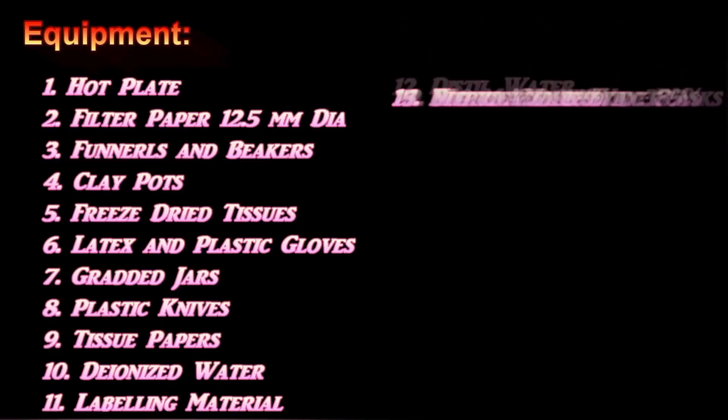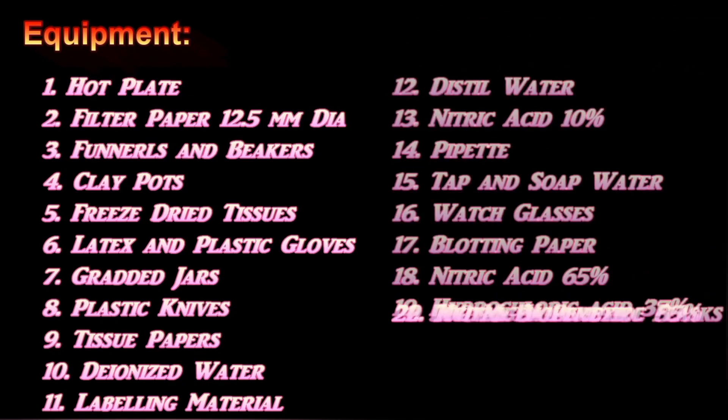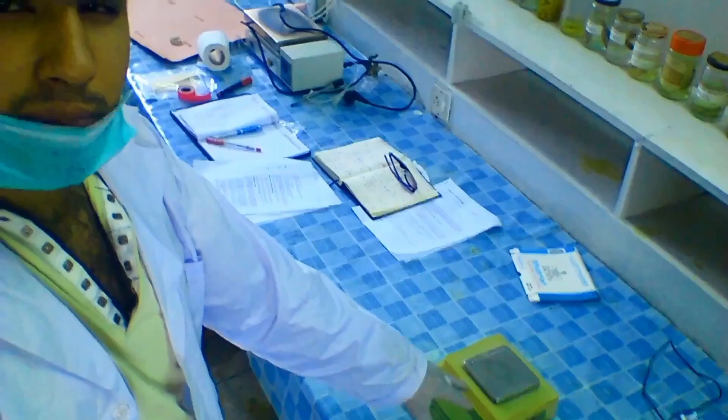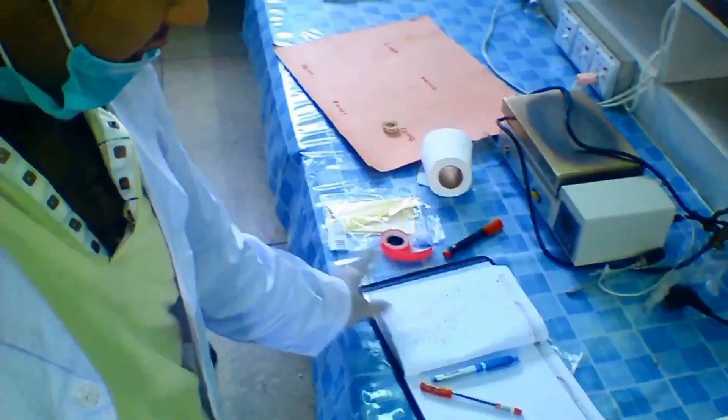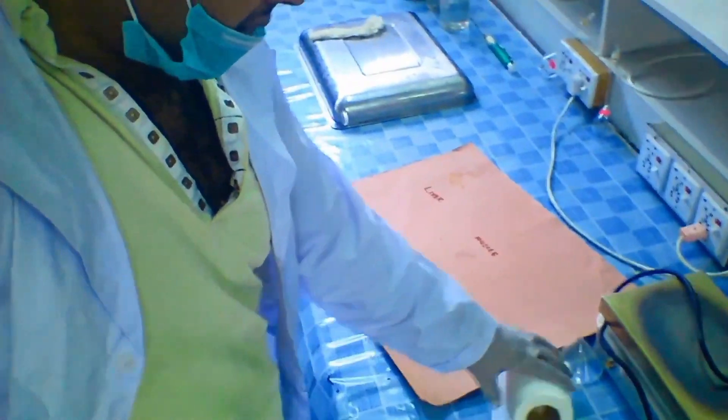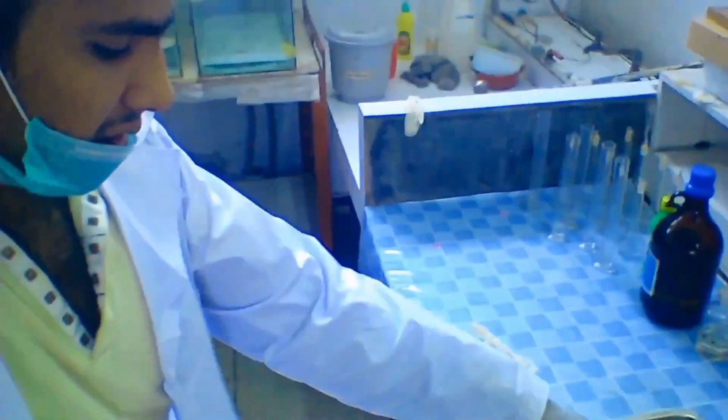The list of apparatus required to complete the process of acid digestion is on your screen. But first you have to clean everything through 70% alcohol and deionized water. First I have to place the necessary apparatus where it's required so it would be easy to carry out the process. I got my notebook, laptop, all the scales and necessary equipment present in their place.